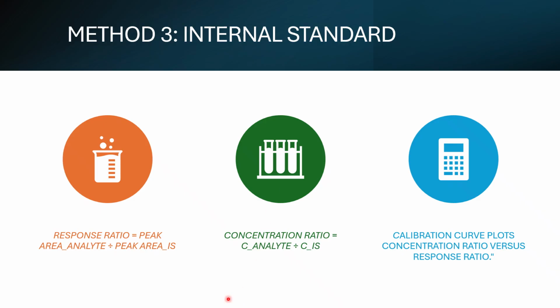And here's the beauty. Since both the analyte and the internal standard experience the exact same conditions, variation and matrix effect, they cancel out in the ratio. What you're left with is pure precision quantification. This is why regulatory agencies often require internal standards for critical measurements.